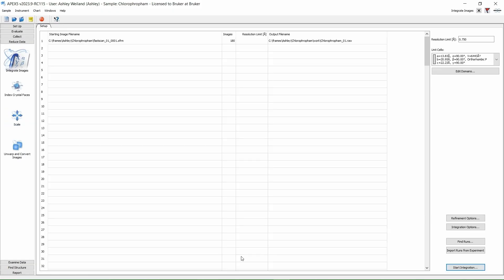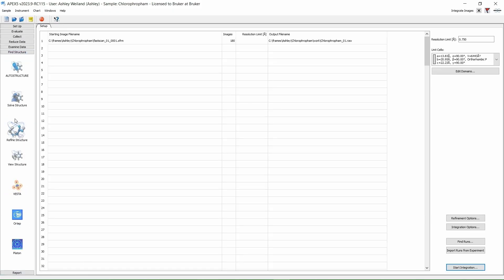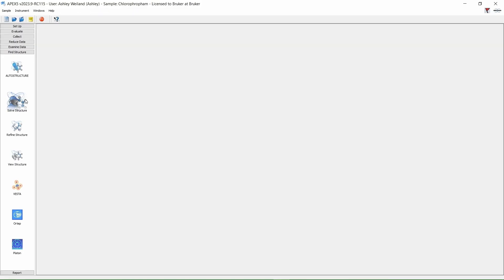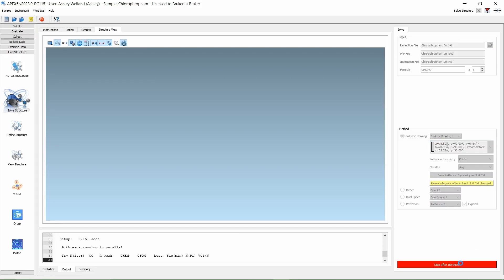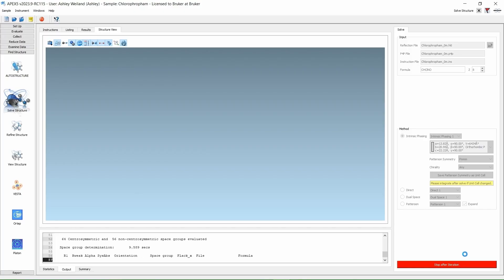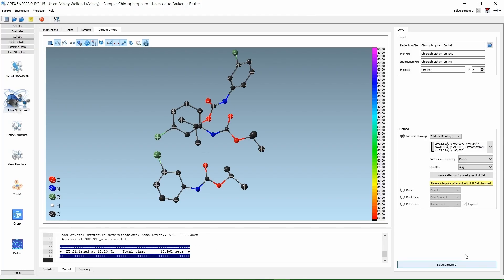We're now going to navigate to Find Structure and then Solve Structure. Because we're going to use Intrinsic Phasing to solve our structure, we don't need to input a space group. All we need here are the elements in our formula and our unit cell. Click Solve Structure. After some thinking, we get a beautiful structure solution of this chloroprofam sample.